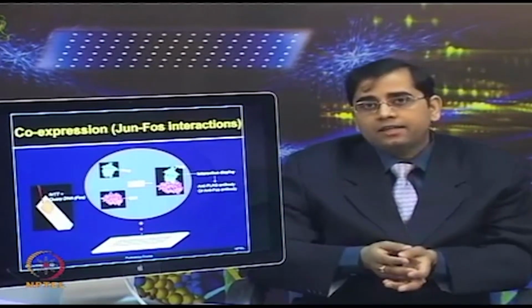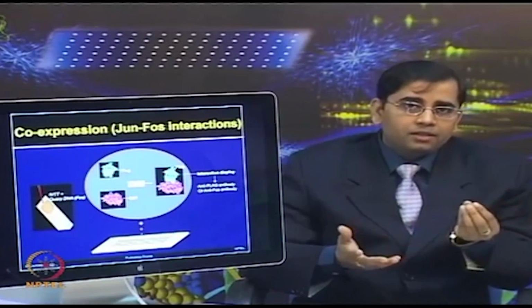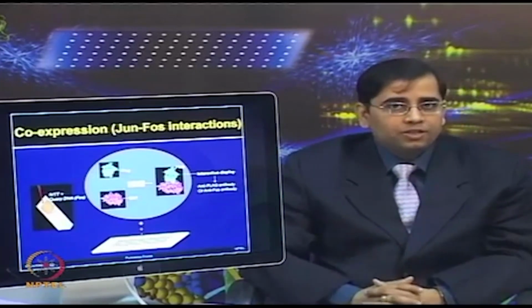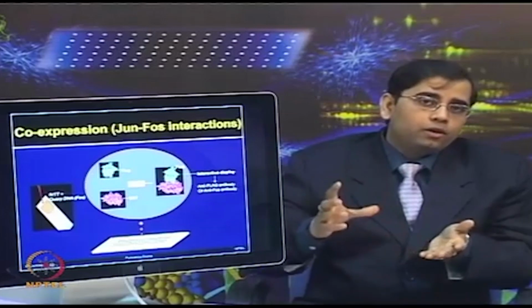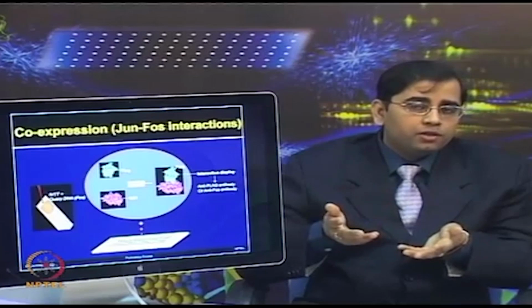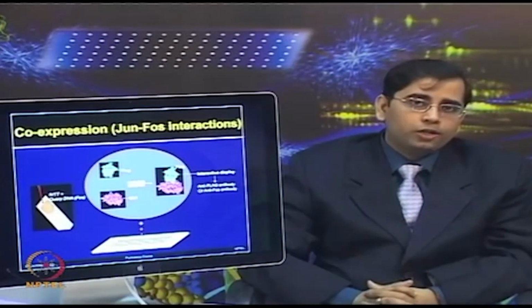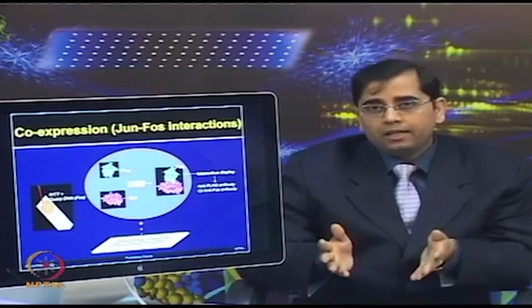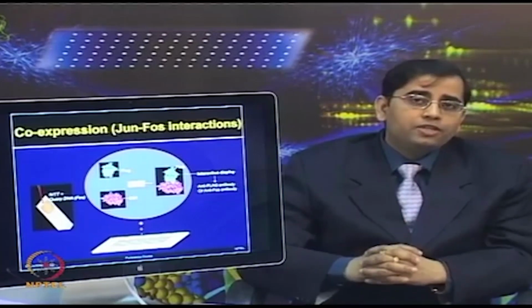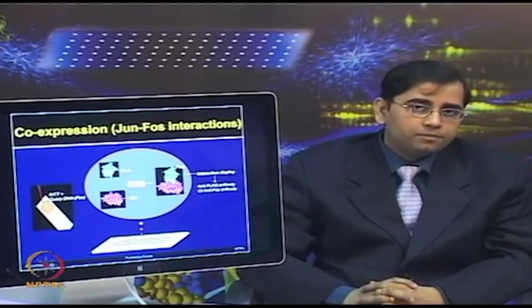When the protein interaction study has to be performed, you take the cDNA of Fos, for example, and mix it in the rabbit reticulocyte lysate along with the other in vitro transcription translation machinery. You mix the whole cell lysate on the chip surface, and after incubation, when proteins are expressed, the query cDNA will also express the protein, and if it finds its binding partner, it is going to bind to those features, which can be detected by using protein specific or tag specific antibodies.